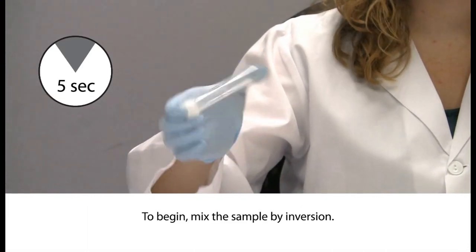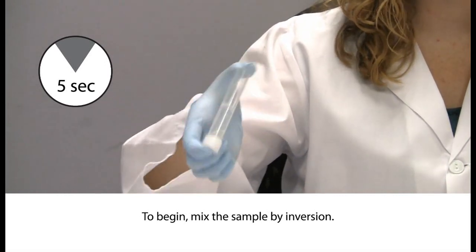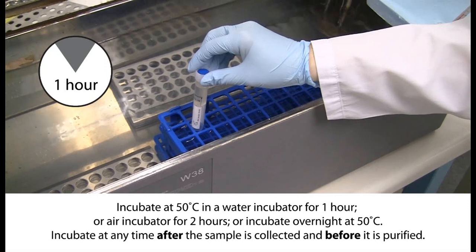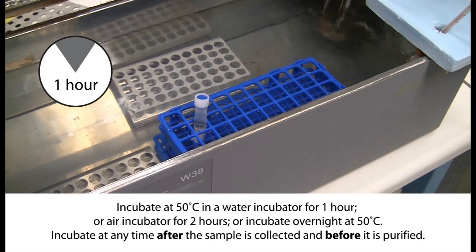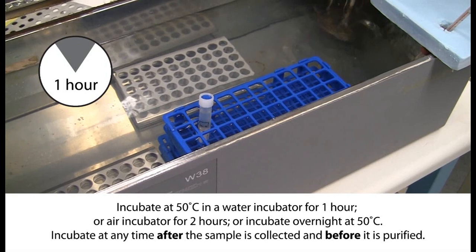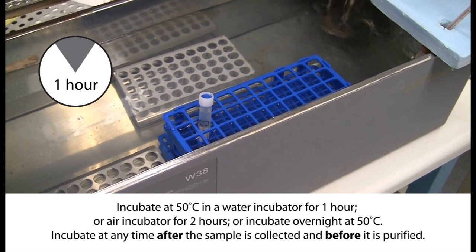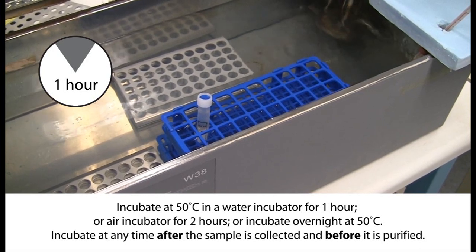To begin, mix the sample in the DNA Genotech Collection Kit by inversion and gentle shaking for 5 seconds. This is to ensure that the viscous samples are properly mixed. Incubate the sample at 50 degrees Celsius in a water incubator for a minimum of 1 hour, or in an air incubator for a minimum of 2 hours. The sample may be incubated overnight if more convenient. This heat treatment step is essential to ensure that DNA is adequately released and nucleases are permanently inactivated. The entire sample must be incubated in the original collection tube before aliquoting to ensure sample homogeneity.